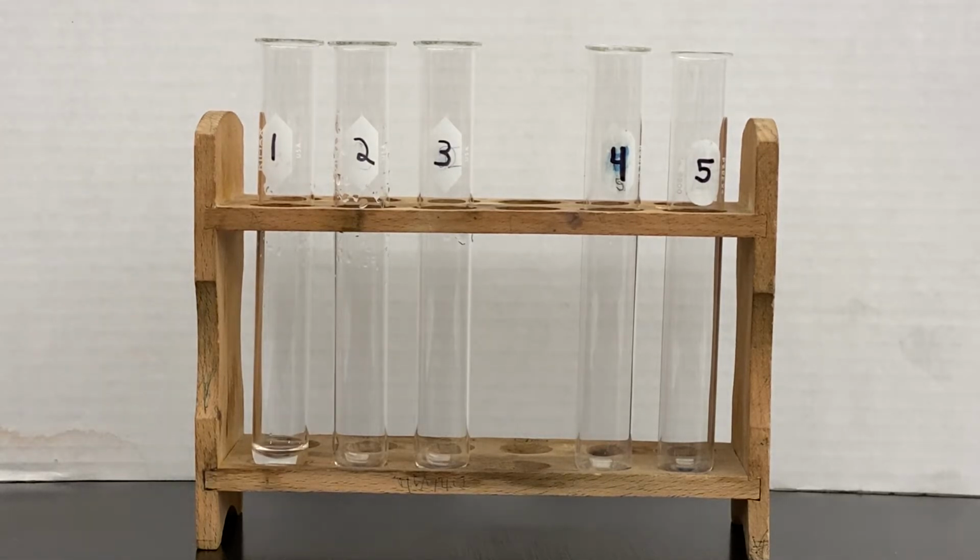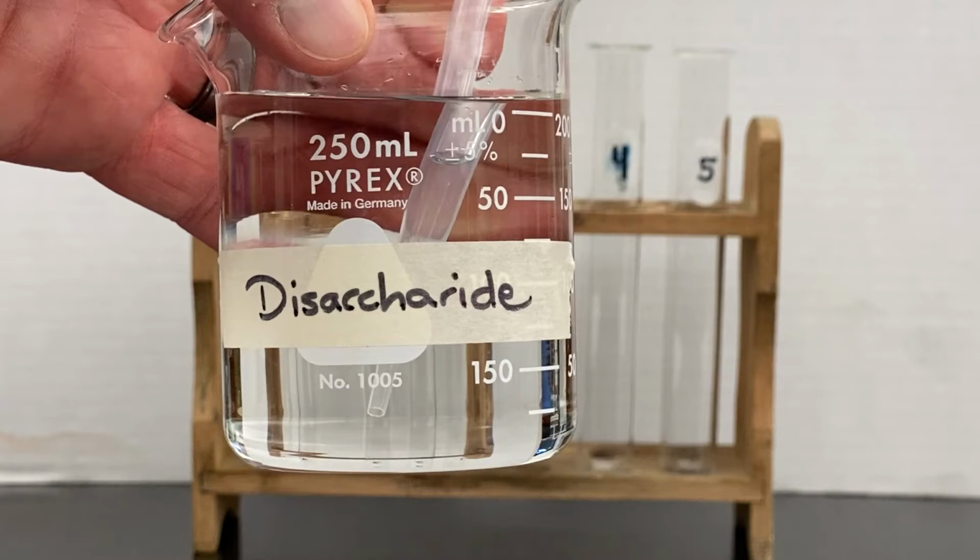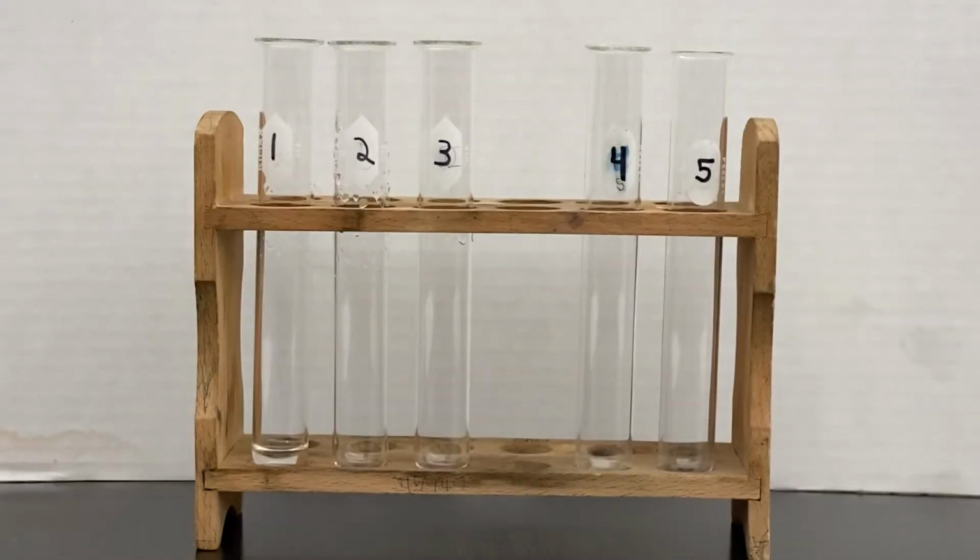Okay, and I'm going to take 30 drops of the disaccharide solution and put it in test tube number 2.